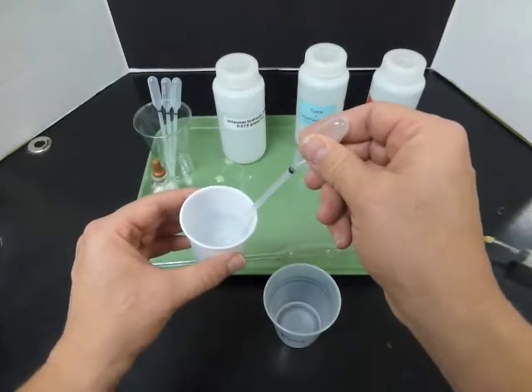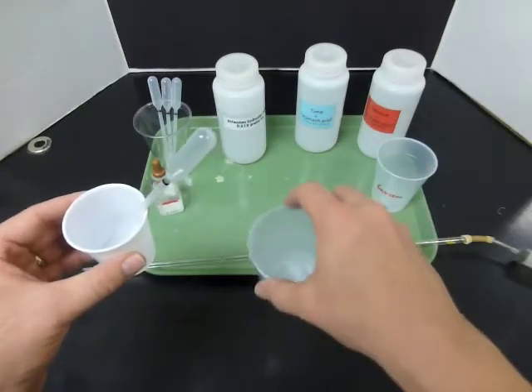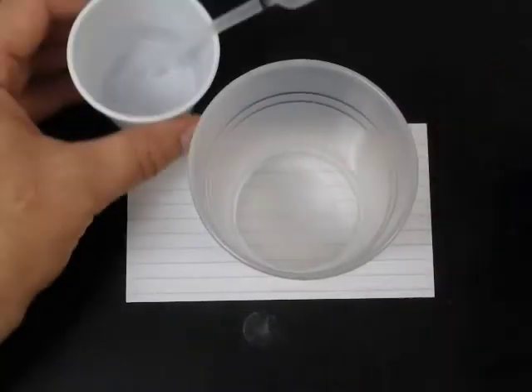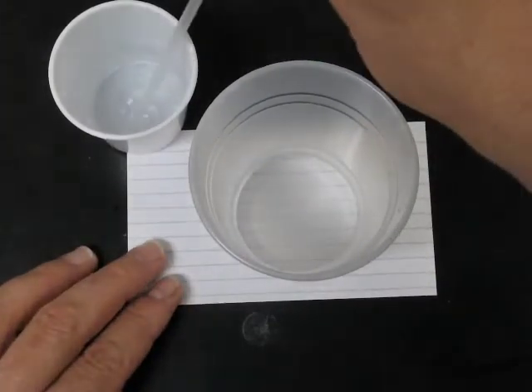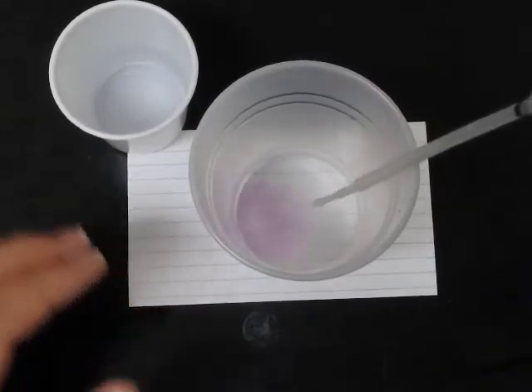So this is going to be 3. And I'll keep going until it turns pink and stays pink. Let me skip ahead and show you what that's going to look like. Okay, I've been adding 1 milliliter of my potassium hydroxide solution at a time, and I think I'm getting pretty close to the end point because it's starting to turn pink. So I'm going to add another one here.